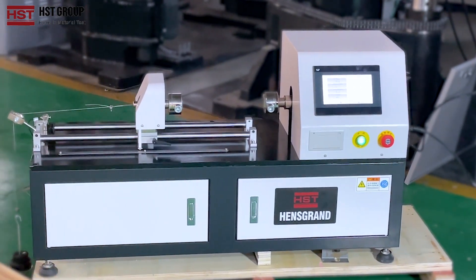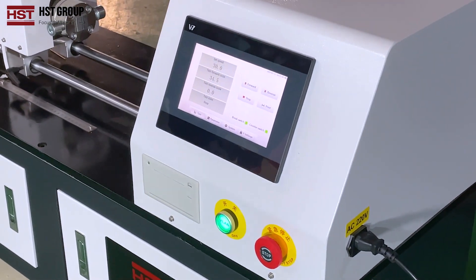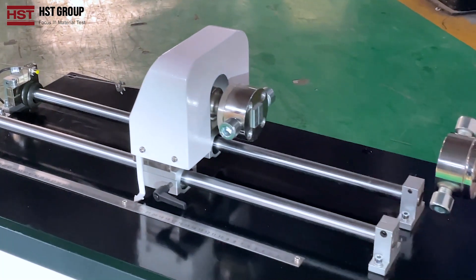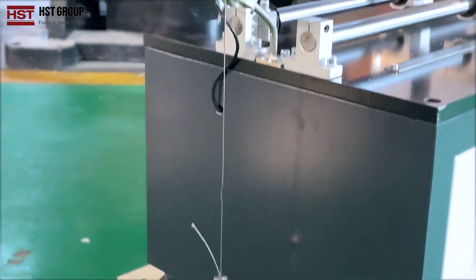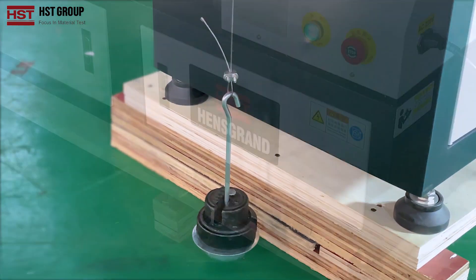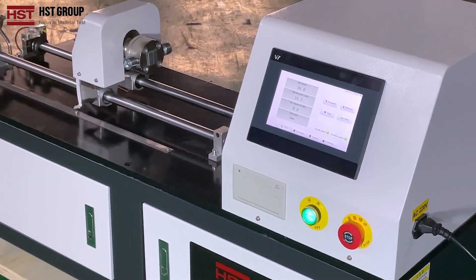HST-HEZ series wire torsion testing machine. The wire torsion testing machine is suitable for measuring the ability of metal wire with diameter of 1 to 10 millimeters to withstand plastic deformation in unidirectional or bidirectional torsion, and for showing the defects on the surface and inside of the wire.